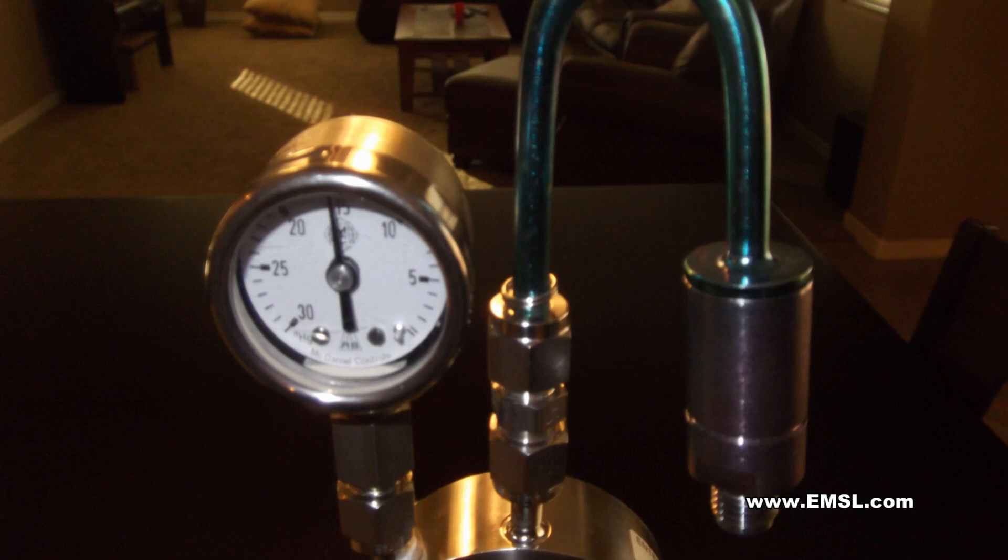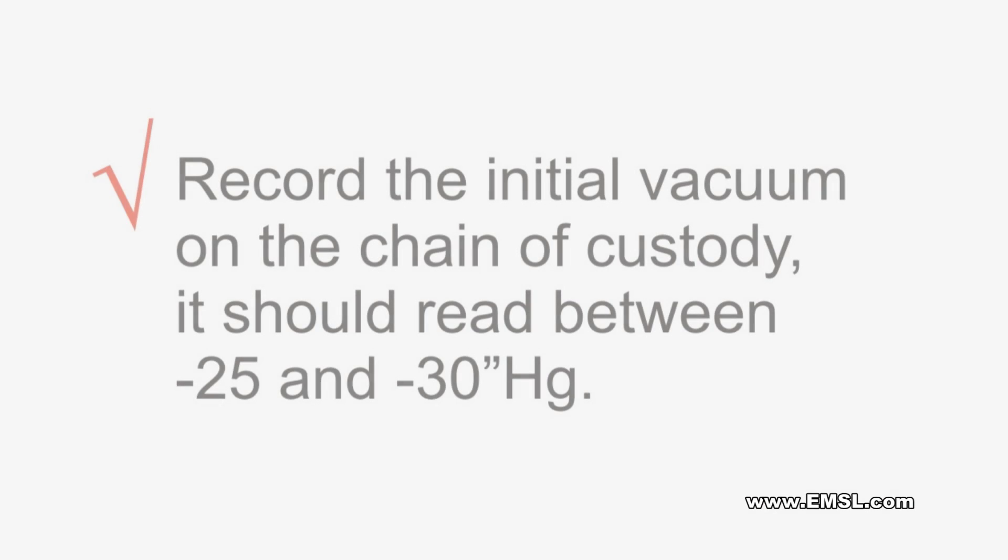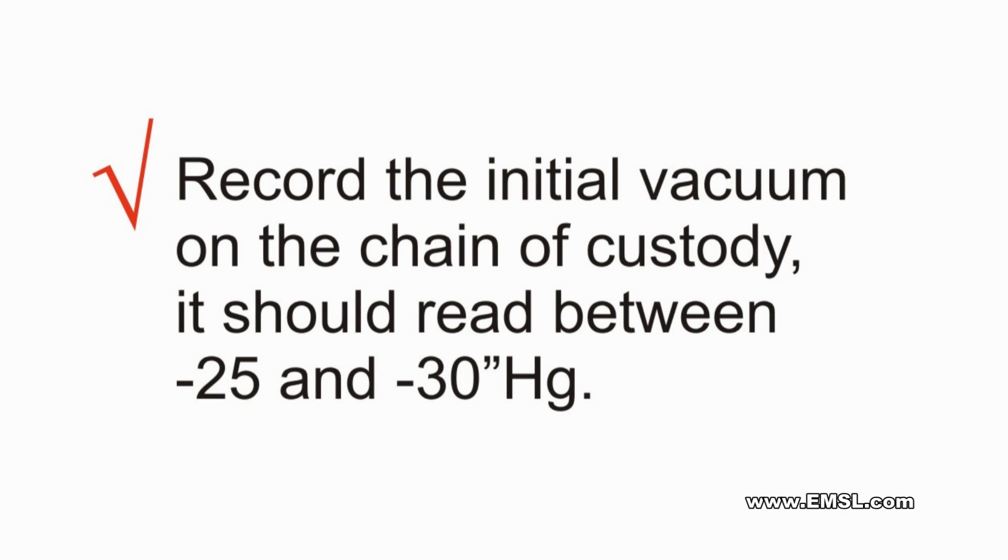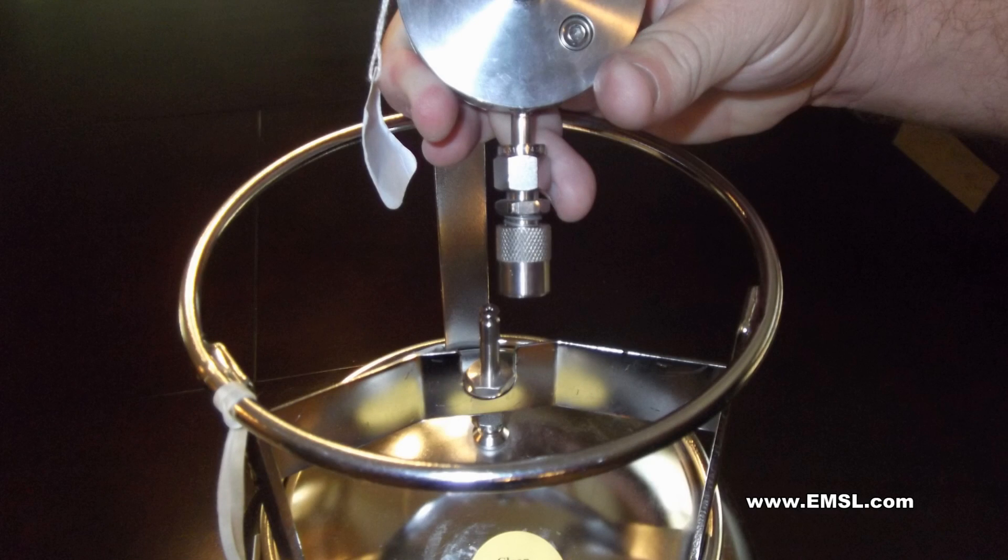Sampling begins when these two parts are engaged. Check the initial vacuum and record it on the chain of custody form. If the initial pressure does not read between -25 and -30 inches of mercury, disconnect and then reconnect the QT valve.